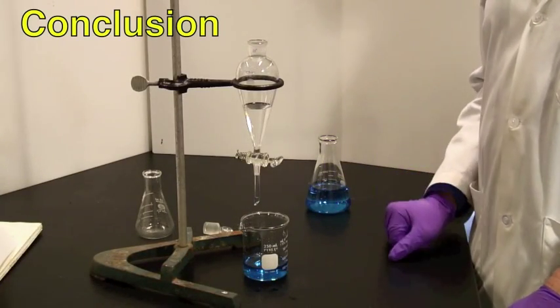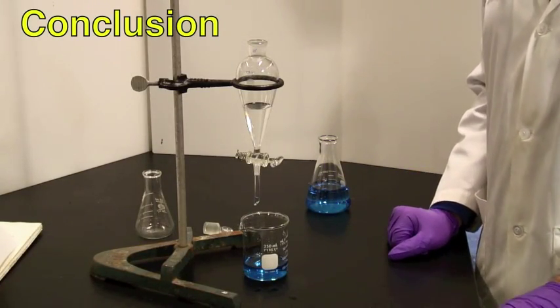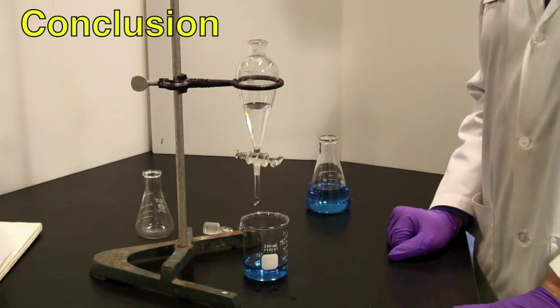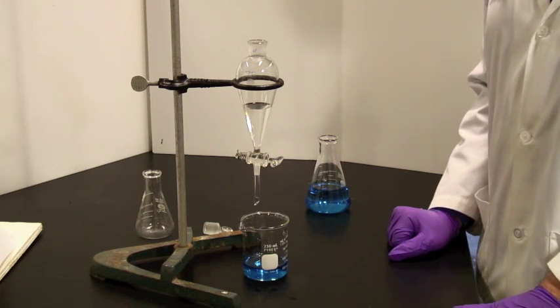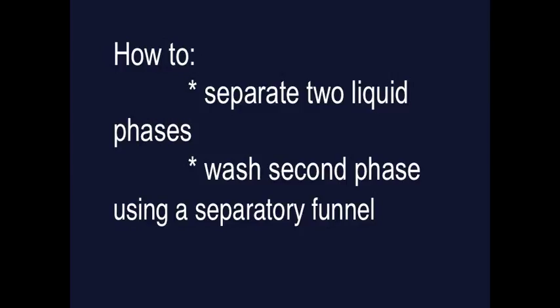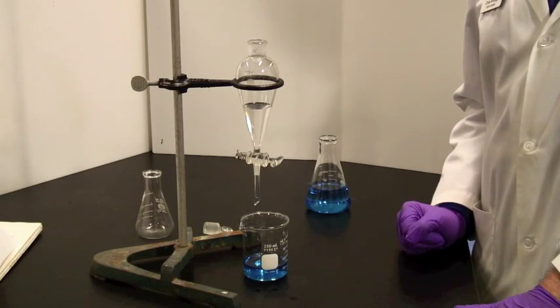Two phase separation is a process of separating different products from a reaction and solution. It's useful for purifying the products. You should now, having watched this, understand the process of two phase separation and how to wash solutions using macroscale apparatus, the separatory funnel.